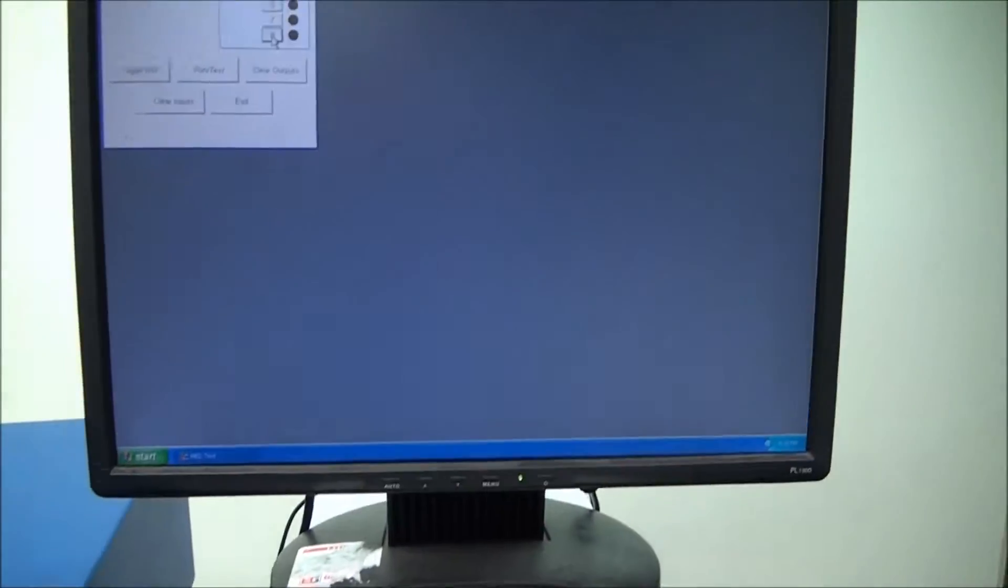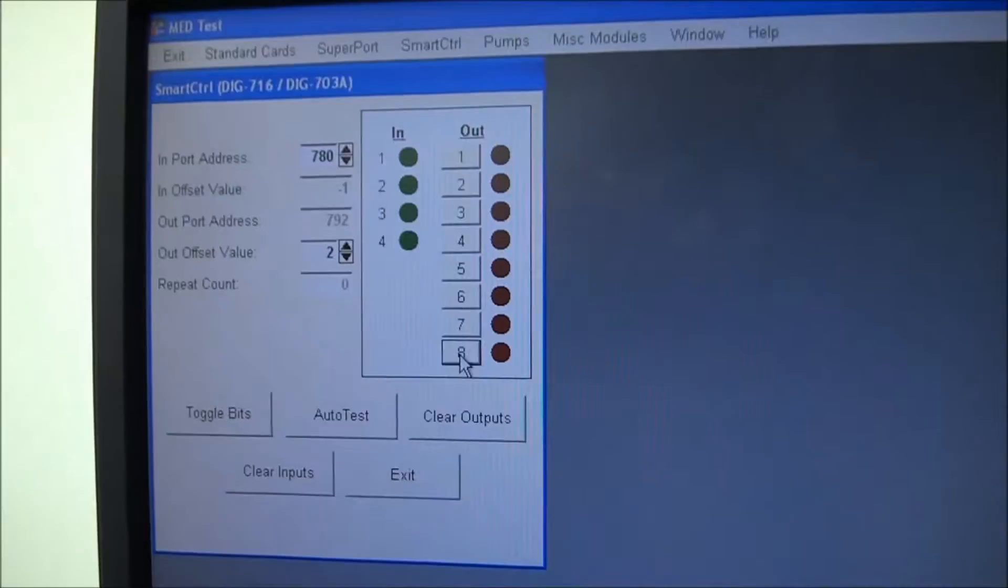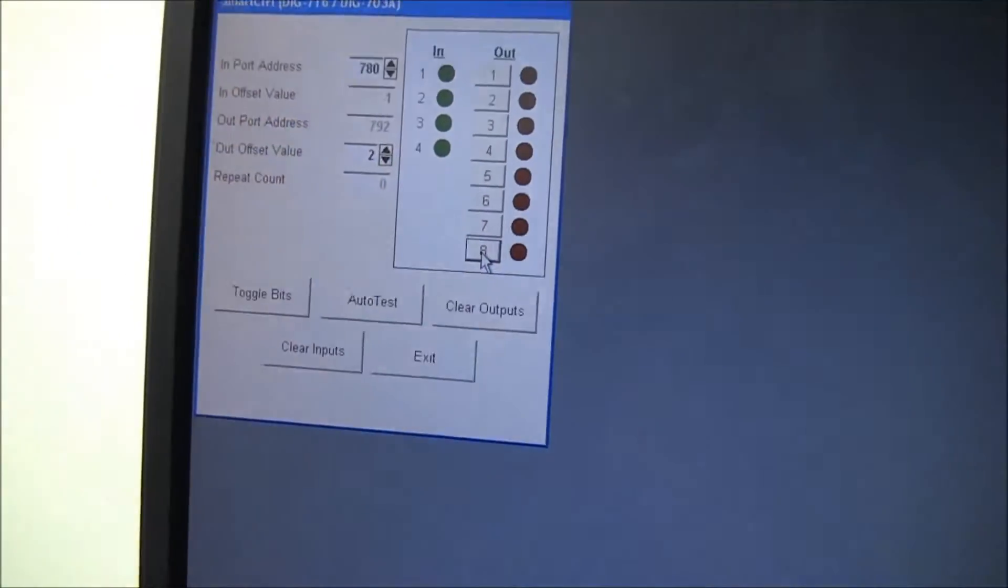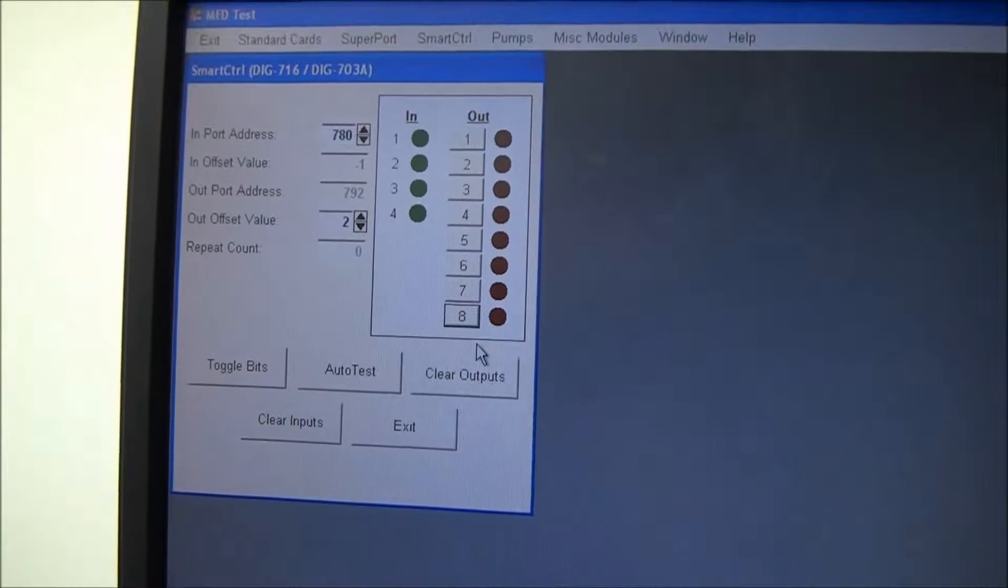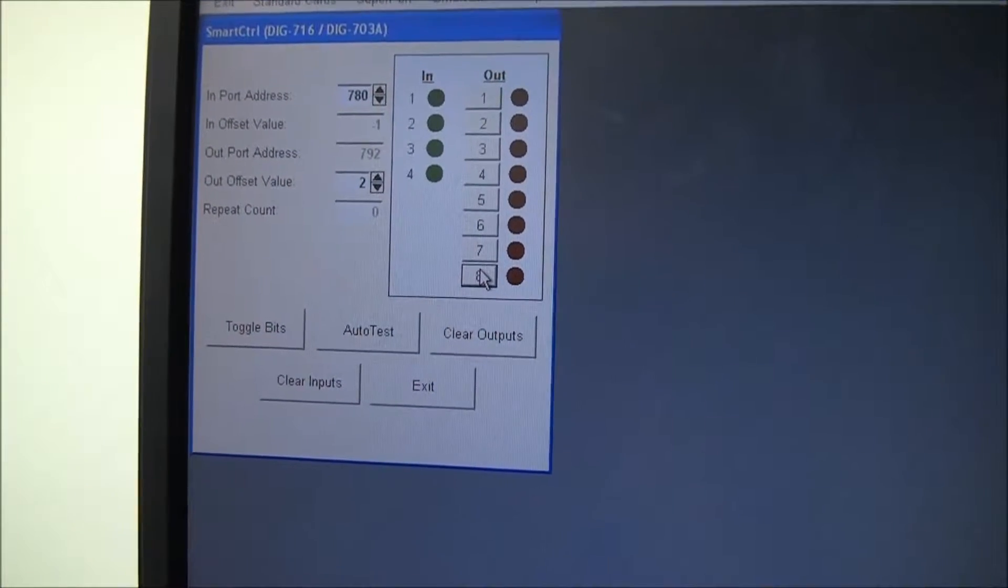And then up here, we're just running what they call a med test. And it's just input-output signals. And we just pulled this up because we're not writing any programs. But I'm just going to give you a little demonstration here. Right now, I've got it set on the chamber that's closest to it.